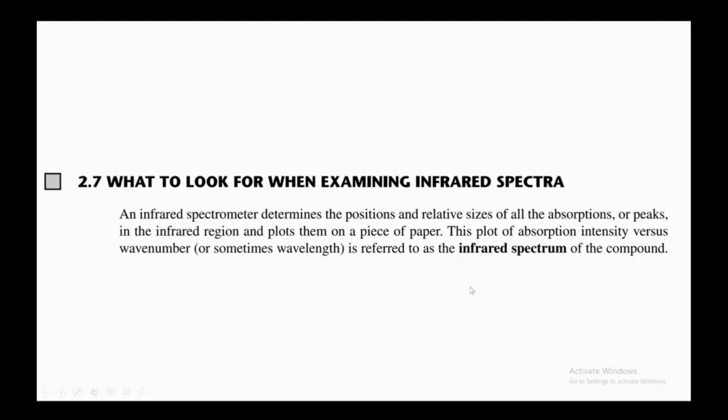Hello everyone, in this video I'll be talking about how to interpret IR spectra. What I have covered previously about IR spectroscopy is available on my YouTube channel. There are a couple of videos: first, the introduction of IR spectroscopy, then the instrumentation of IR spectroscopy, and then I have discussed the sample preparation for IR spectroscopy.